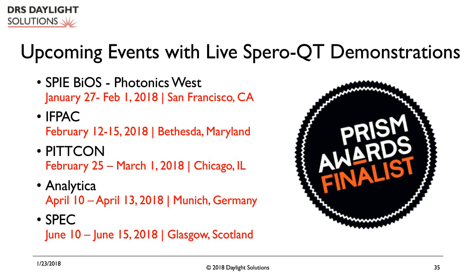Bill, this one goes to you. Do you have a spectral library built into your software? We currently do not. We find most of our users customize their spectral libraries specific to their application. Spectral libraries are commercially available and can be used with the Spero.